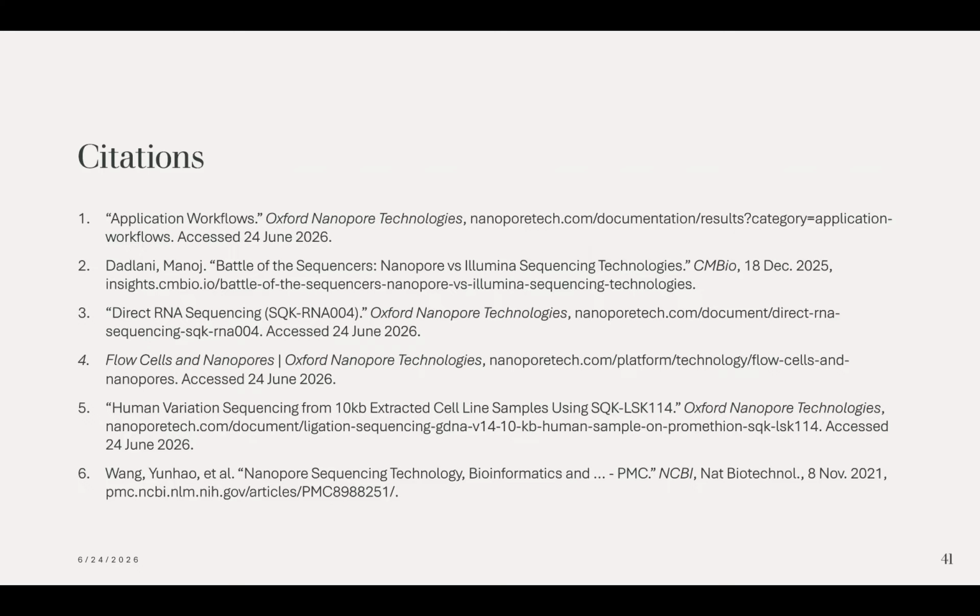Yeah, definitely. The ONT documentation provides the exact numbers, but I believe that for DNA, at least with the protocol that I've been using, it's 1 microgram of DNA starting out. So not a ton. If you're extracting from a plate of fibroblasts or iPSCs, you can usually get that from just a 10 cm plate pretty easily. And then your second question, how many samples prepped at one time?